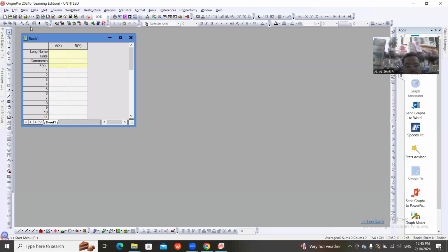Now, for the update: before updating this program, I was talking about the helpful video, but it was before the update. I struggled too much because of a few simple things. For example, in the helpful video on YouTube, all the respect to this YouTuber, because her or his purpose was to help us, he was using this file and opening some options we must do to create our X-ray diffraction pattern.